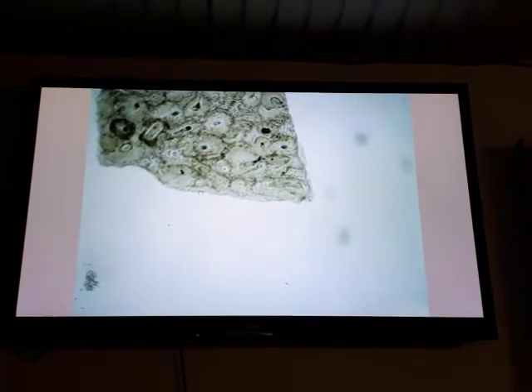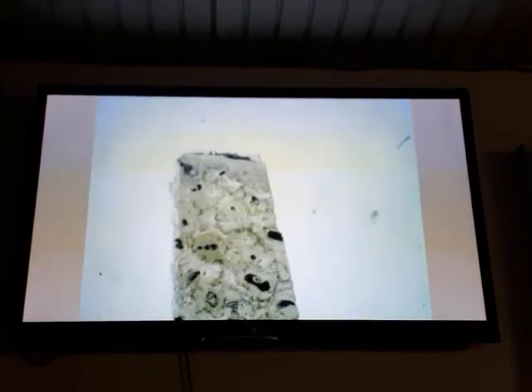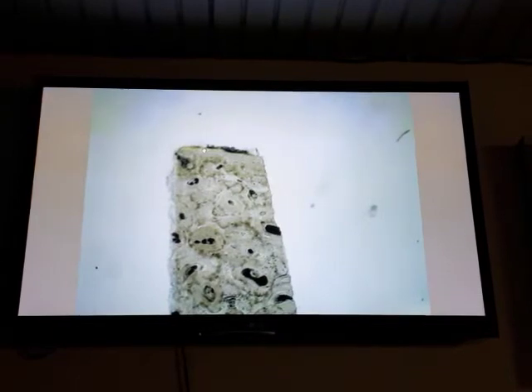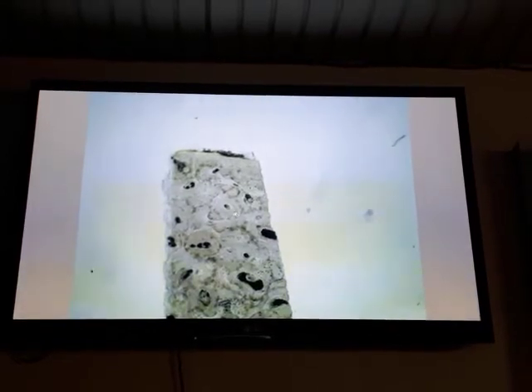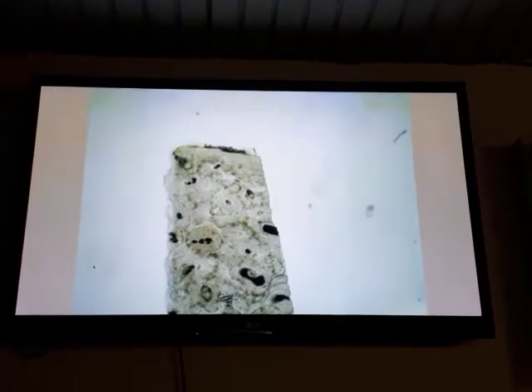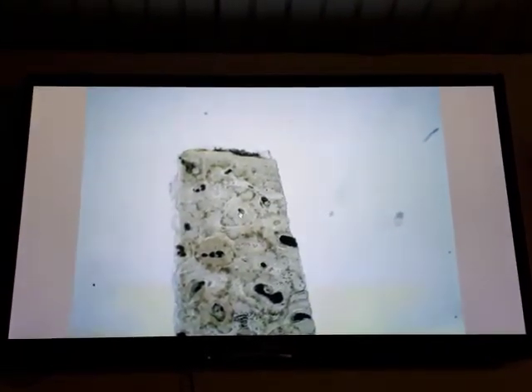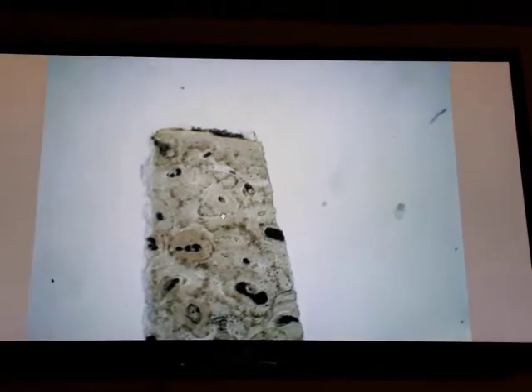Endosteum is located around the marrow cavity. This slide is sectioned by the ground technique. We have a spherical or rounded structure. This complex is composed of a central canal called the Haversian Canal surrounded by concentric laminae. This structure is called the Haversian system or osteon.